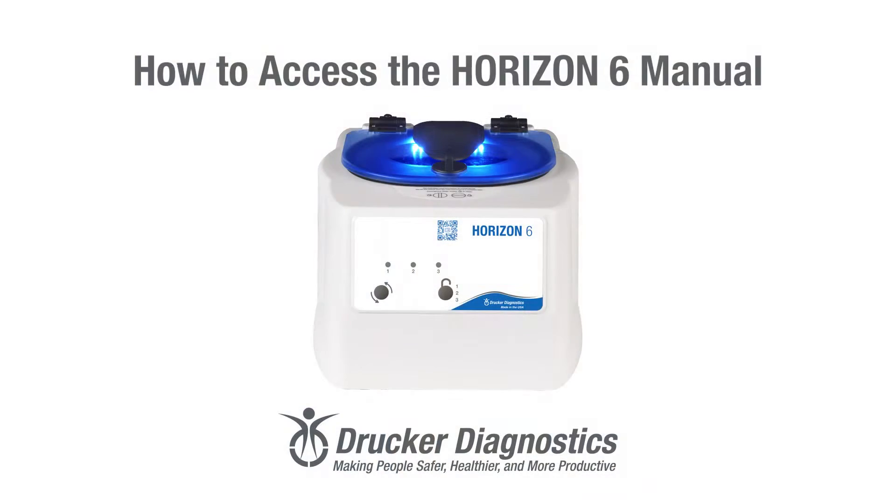Hi, I'm Dawn with Drucker Diagnostics, and today we're going to access the Horizon 6 manual using the QR code on the front of the centrifuge. Your Horizon 6 has a QR code on its front panel label. This QR code will take you to a convenient owner's portal with a variety of helpful links for your centrifuge, including the manual.